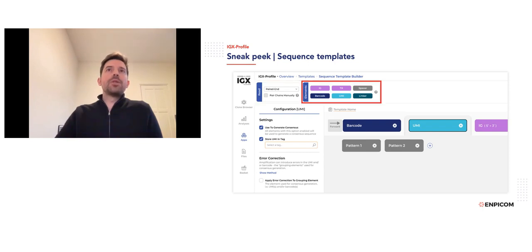And if you focus your attention on the center part, you can see all the different elements that you can use to compose your amplicon structure. The way this works is you can click and drag any of these elements, such as, for example, an IG block or a TR block for antibody or TCR receptor data, respectively. You can see a barcode block, a UMI block, and linker blocks.